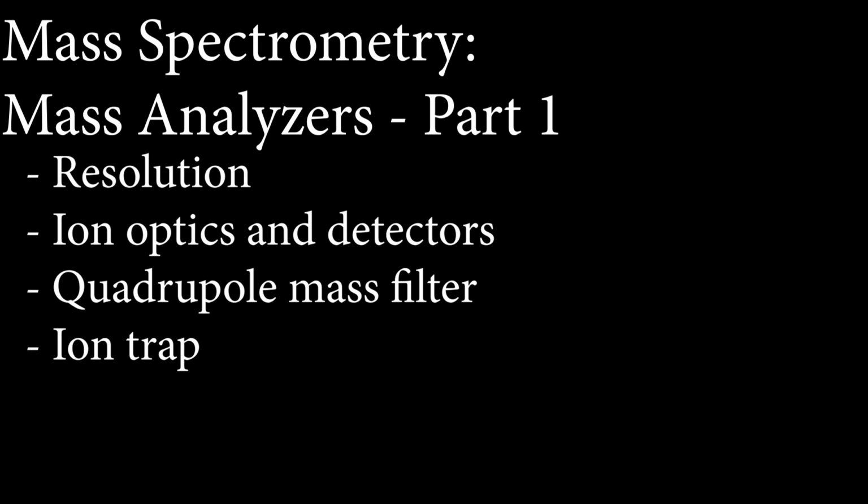Okay, good job hanging in there with the discussion of resolution and the complicated discussion of the quadrupole mass filter. Let's finish up with a discussion of the ion trap, in which everything we just talked about with the quadrupole mass filter is going to come back into play.